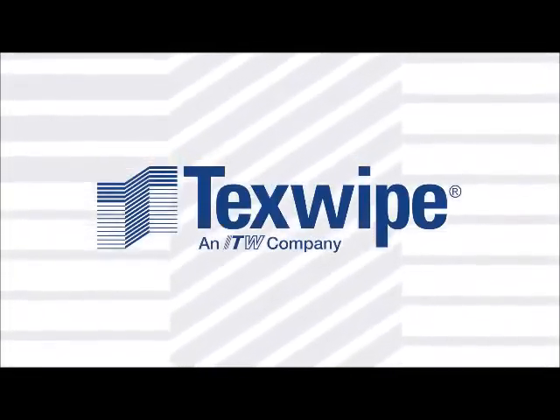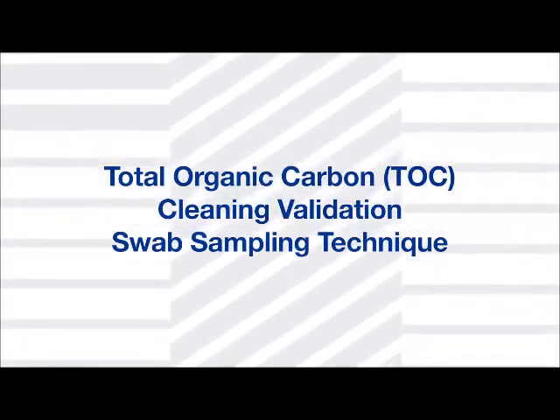Texwipe presents Total Organic Carbon TOC Cleaning Validation Swab Sampling Technique.